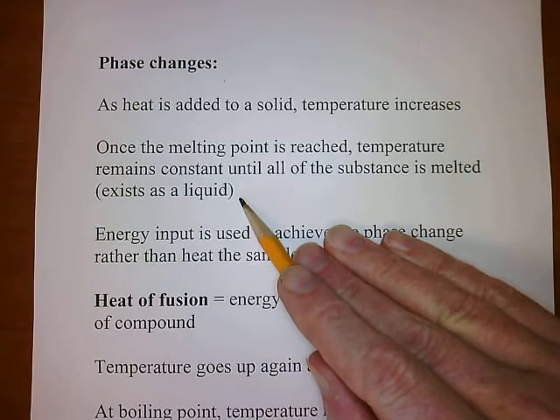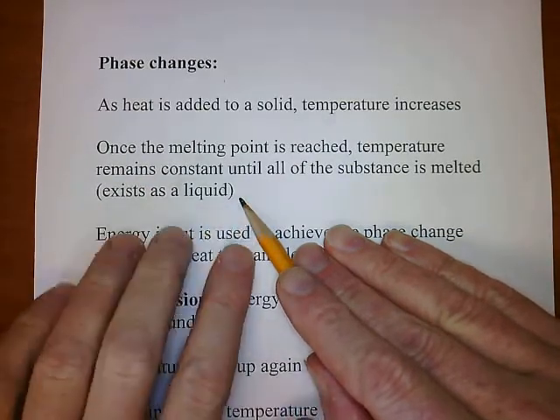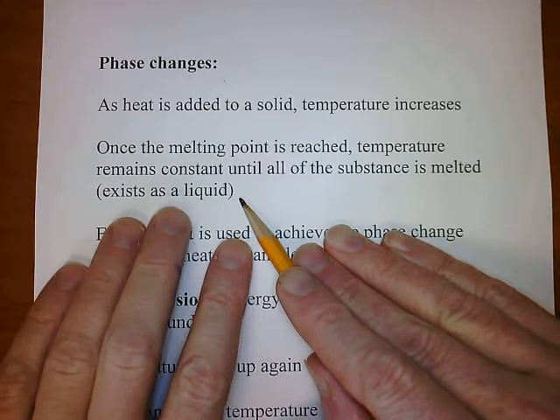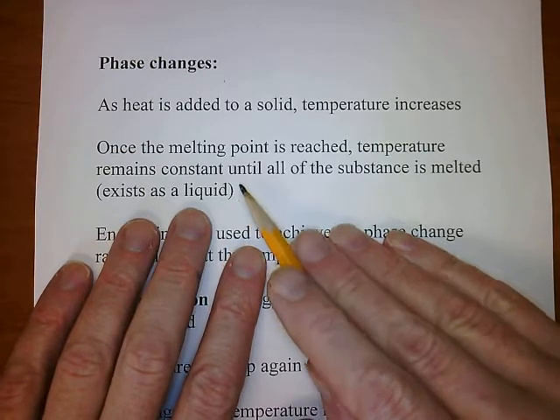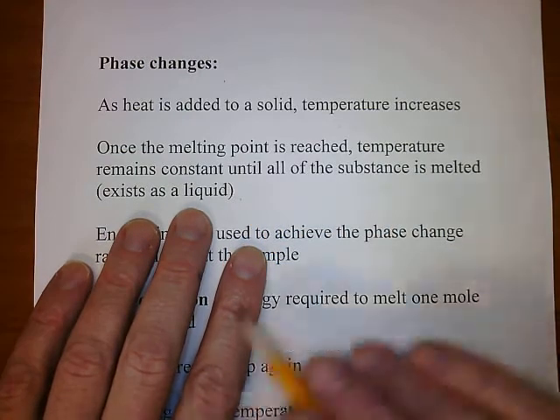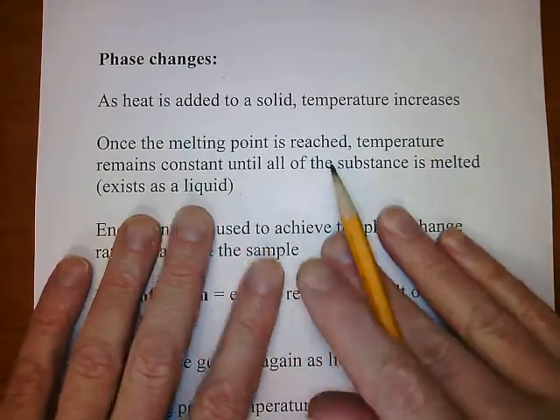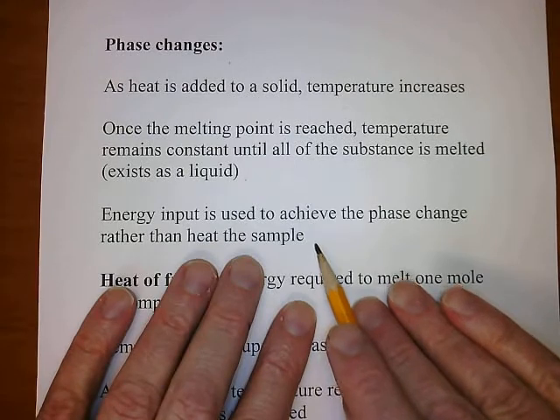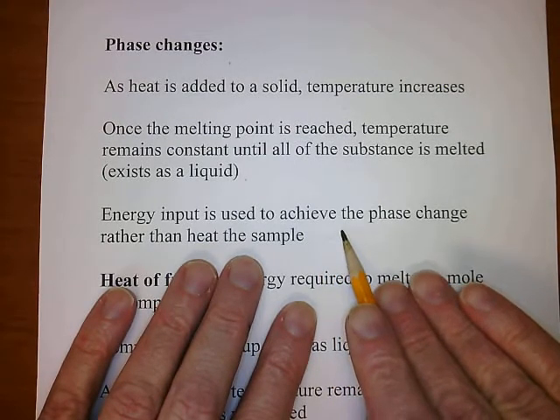So what's going on here? Let's say your substance melts at 6 degrees Celsius. It's frozen, and you pull it out, and the room temperature is 25 Celsius, so heat is flowing into it. But once the phase change starts, there's no further temperature increase. Why is that? Because the energy input is used to achieve the phase change rather than heat the sample.